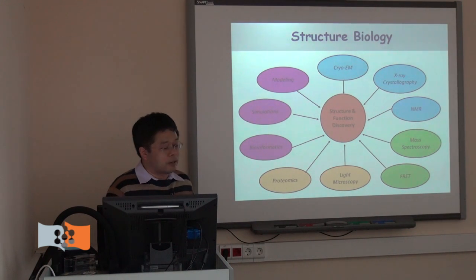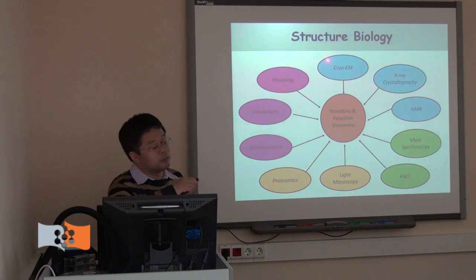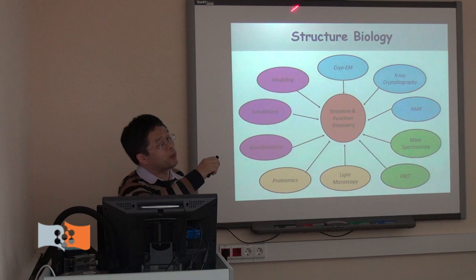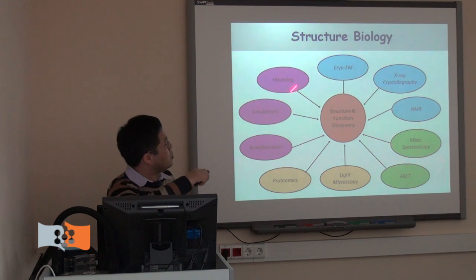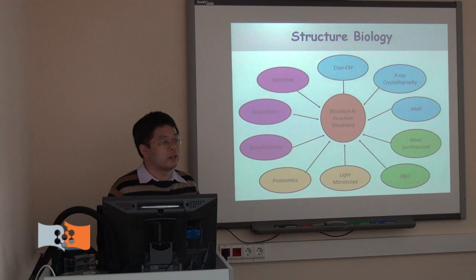cryo-EM. Actually, in my institute, and like Professor James Liu, we are working mostly on a lot of structural biology. So this gives a lot of methods for how we study the structure and the functional study of the molecules and the complexes.